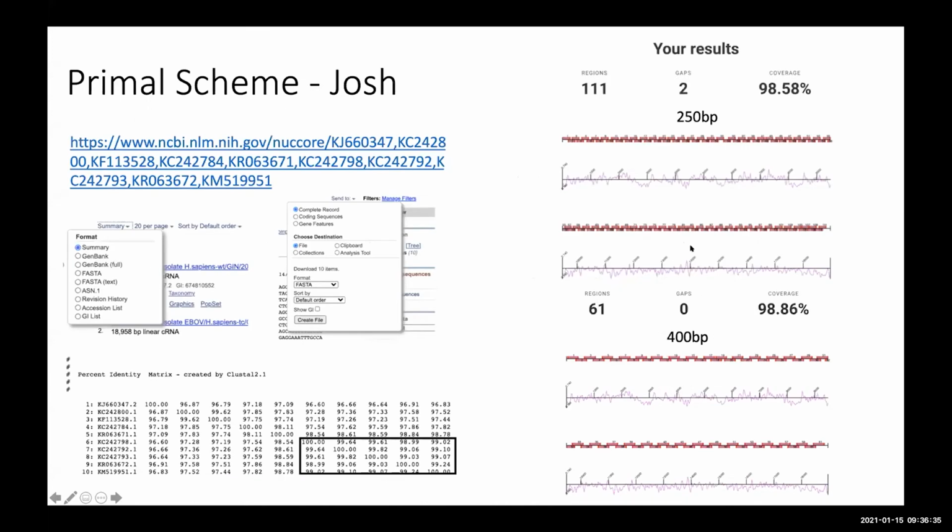So just to go through these steps in terms of the results that you should have had, it's possible using a link like the one pasted here to download all of the Ebola virus genomes by accession number, where the accession numbers for each sequence are separated by commas. And GenBank actually makes it easy for you to first display that in FASTA format by clicking on FASTA under the little tab that usually comes up marked as summary. You can click FASTA and start seeing them in FASTA format, and then you can send them to a file in FASTA format that will end up giving you a text file with all 10 accessions contained within.